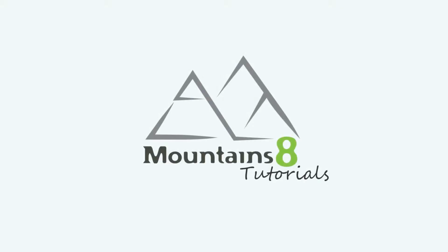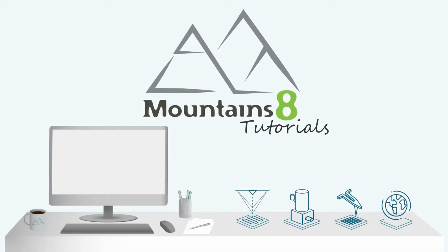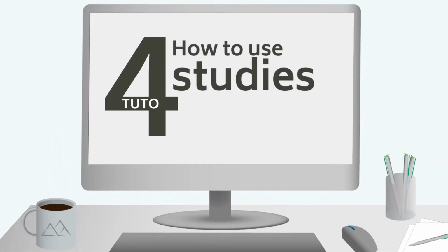Hello, and welcome to the fourth video in this tutorial series on Mountains, Digital Surf's industry standard software for profiler and microscope data analysis. In this video, I'm going to show you how studies work.